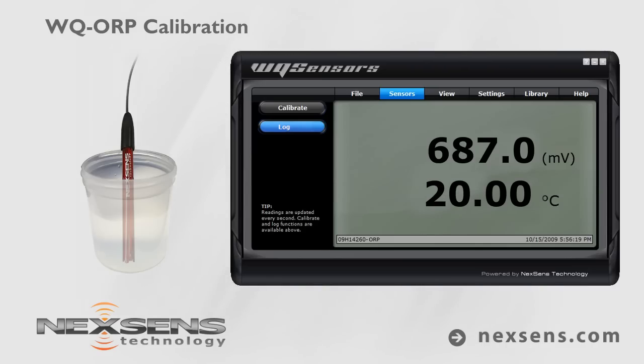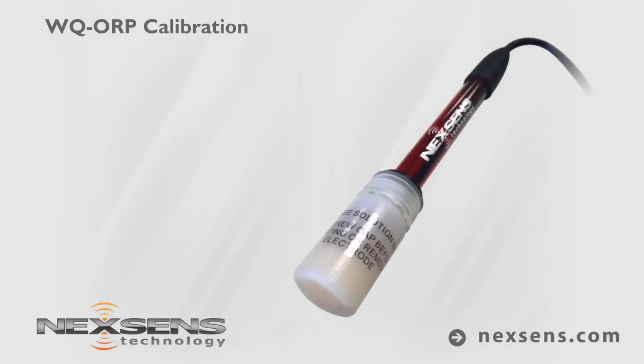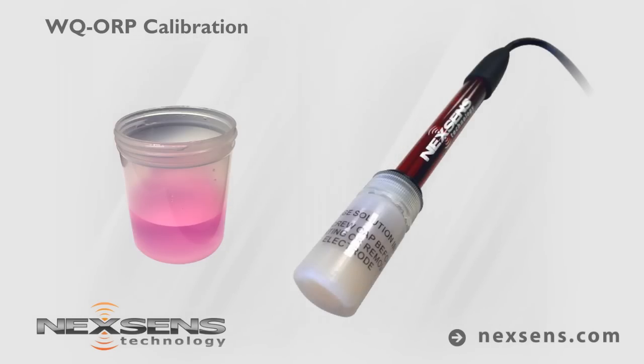Quality data collection requires frequent calibration. For best results, calibrate before each use. When not in use, the WQ ORP sensor should be stored in the original storage solution or a pH4 buffer. A storage bottle is included for convenience.